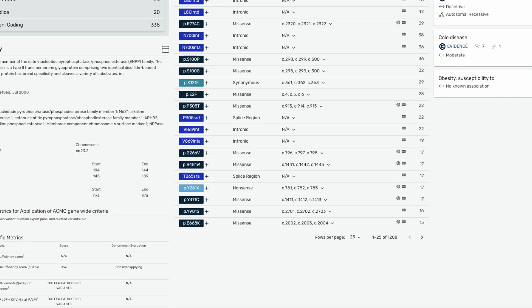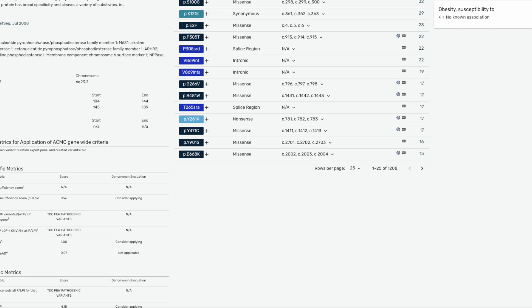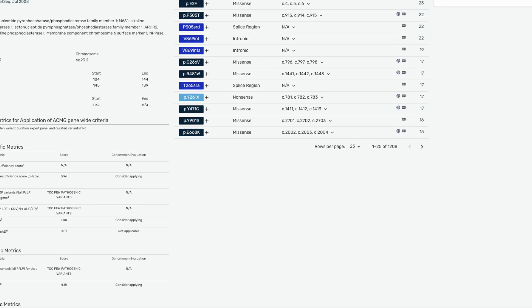Below the gene summary, we provide crucial information from various sources like ClinGen, Decipher, ClinVar, and DBSNP. The data we provide here can be used for gene curation based on ACMG guidelines.